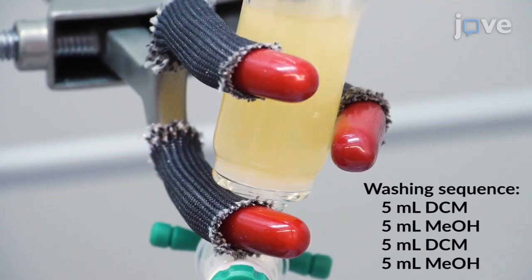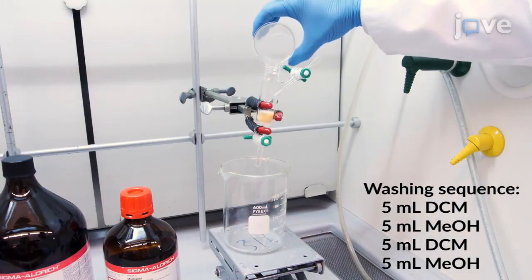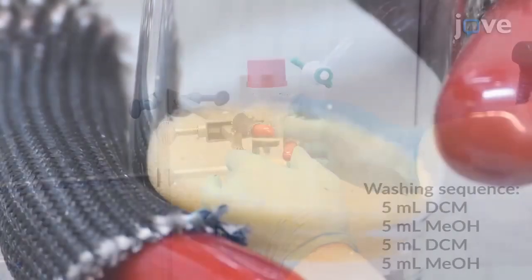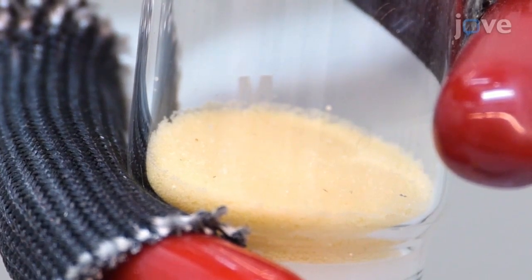After that, wash the resin 4 times, alternating between 5 milliliters of dichloromethane to swell the resin and 5 milliliters of methanol to contract the resin. Then thoroughly dry the resin with compressed air, which usually takes about 30 minutes.